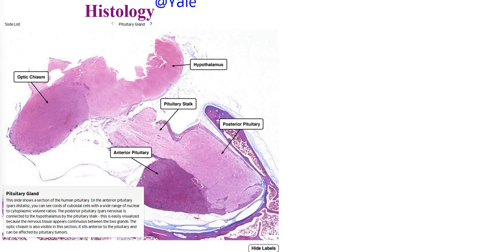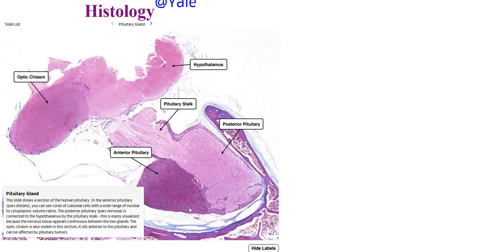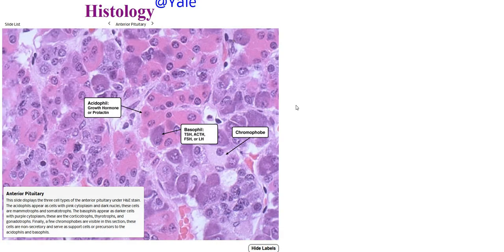We're going to zoom in now. Hopefully I've driven that home for you. So we're back to the anterior pituitary gland. We have zoomed in from this dark part, and now we're looking at individual cells. They're still dark stained. We're going to have basically 3 different types of cells that are categorized based on how much color they take up from the stain, and that's why we see these terms acidophil, basophil, chromophobe.